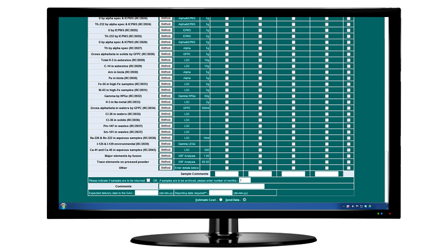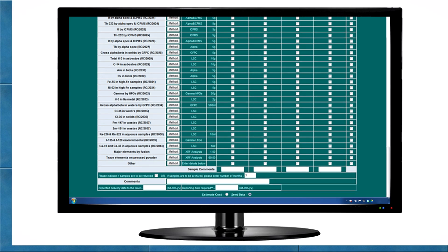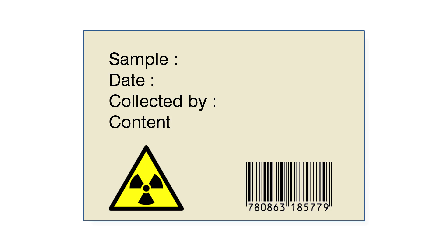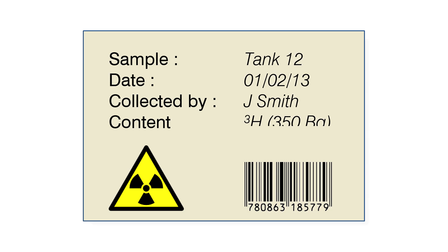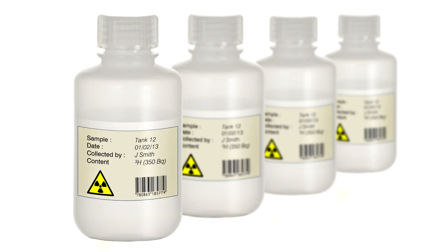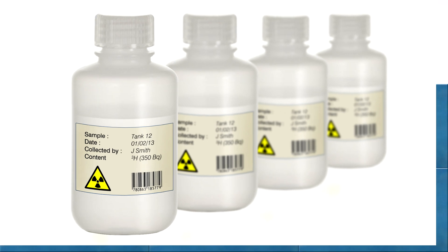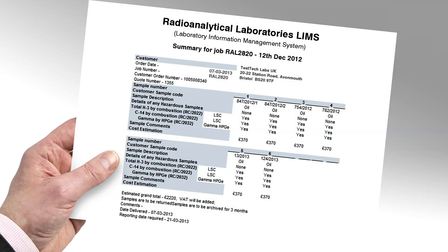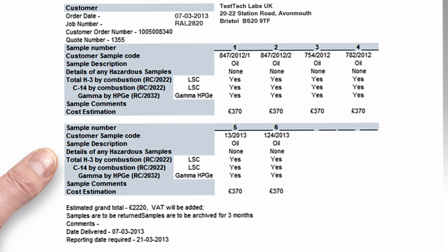As jobs progress, relevant new information can be easily added to enable accurate job monitoring. The system can be used to generate sample labels and barcodes if required. A summary of the job specification is produced, detailing all key information relating to the job, providing a clear job specification for the analysts.